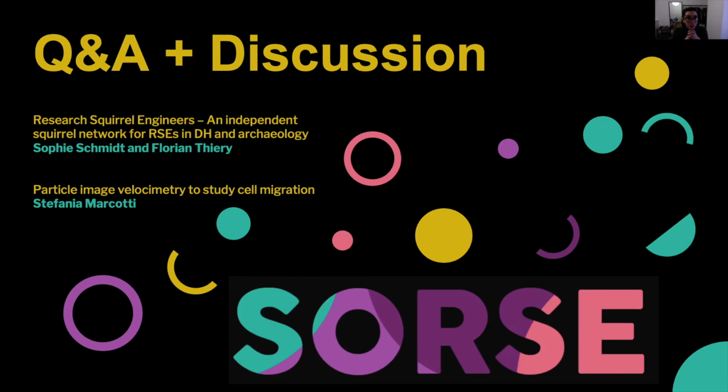Okay, thank you. And one other thing that I was curious about, I don't know if I understood correctly, but I think you said that the movement has to be fairly consistent between frames. So can you have a case where you need to change your parameters between frames, and how do you handle that? Can you have a case where something moves much faster in one set of frames than in another? Do you end up with a search space that's too small or too large, and how do you work around that?